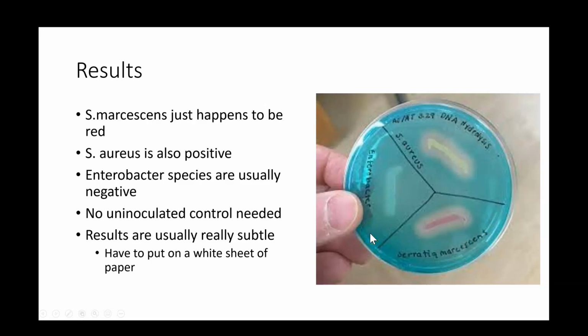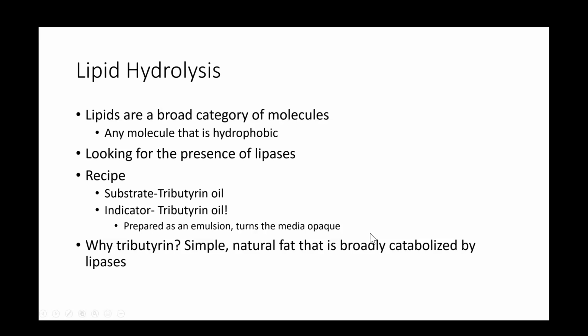All right, let's look at lipids. So can bacteria eat fat? It turns out that they can.